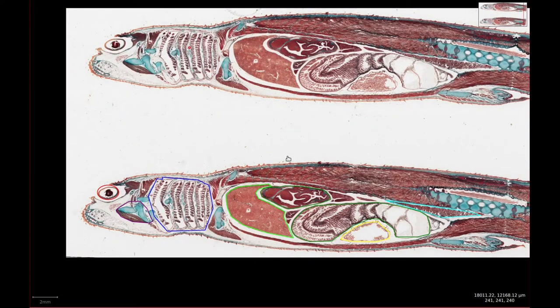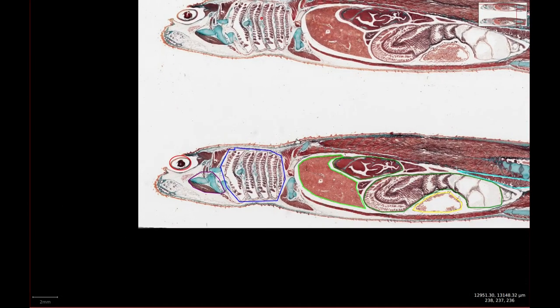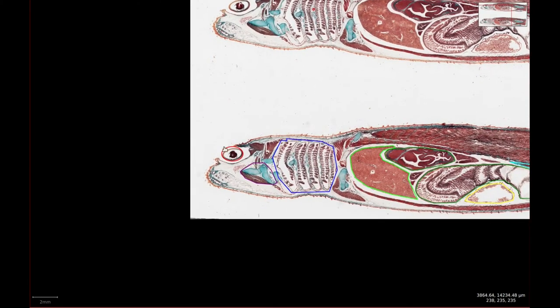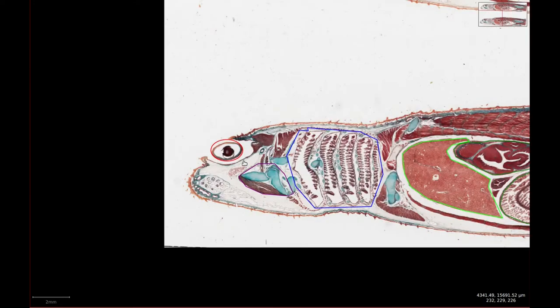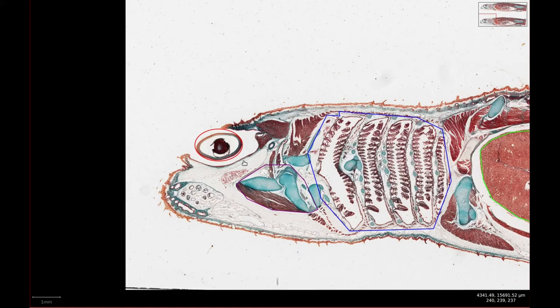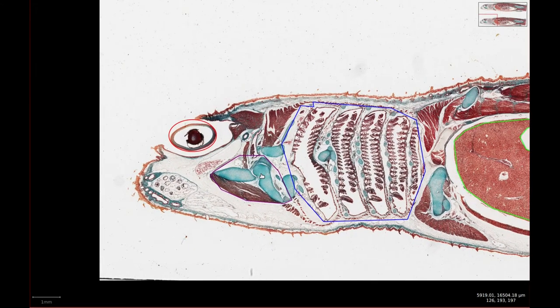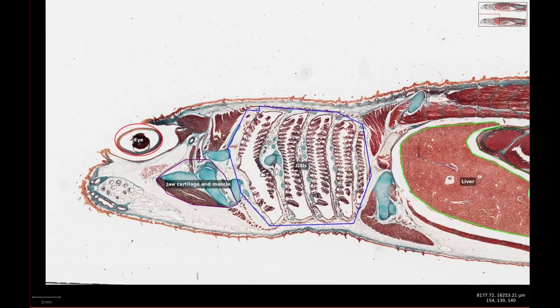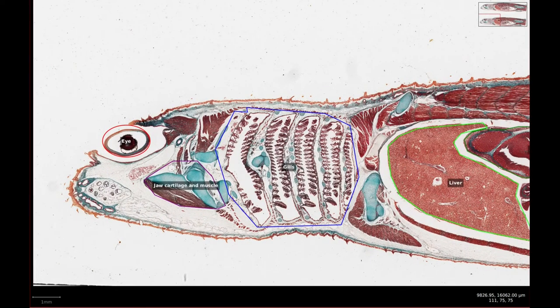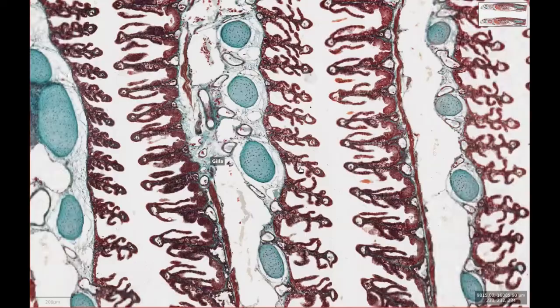The most lateral section is slide 241. In terms of head structures, only the eye is present with no brain or skull left. It's so lateral that there isn't even an obvious oral cavity, only the cartilage and muscles of the jaw. Instead, we have a great view of the five gills with their branching tree-like gill filaments and lamellae.